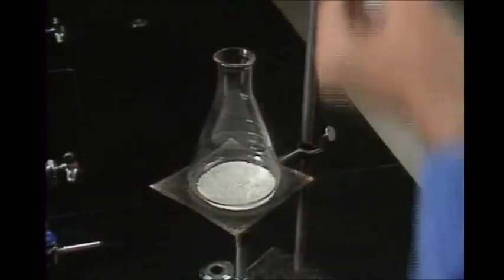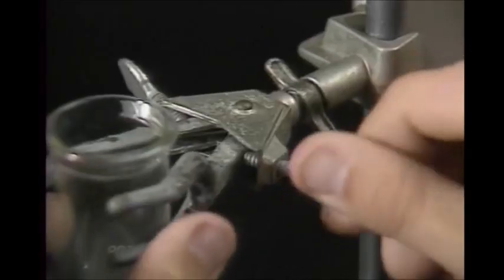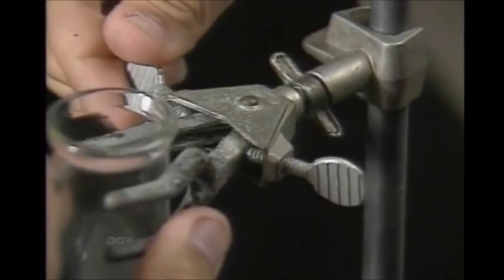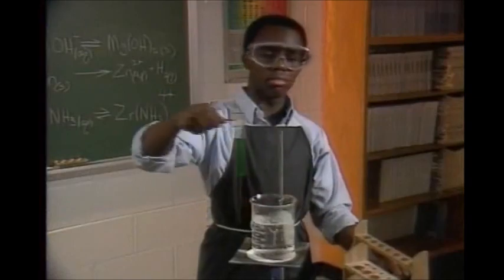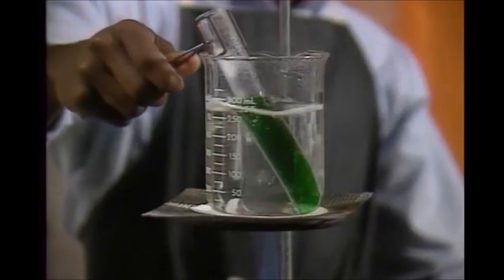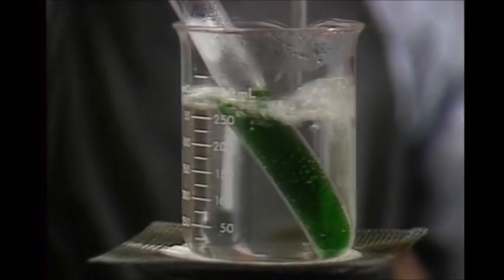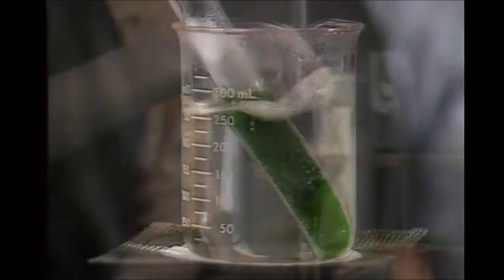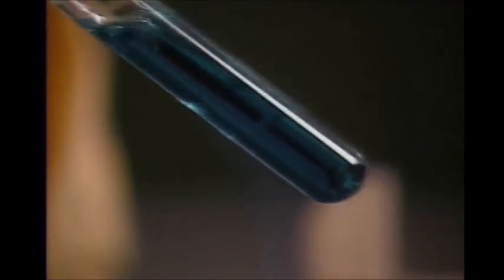Flat-bottomed containers are normally heated on a wire screen on a ring stand. Erlenmeyer flasks and other narrow-necked containers should be secured to the stand with a clamp. Test tubes can be heated in a water bath. The water bath transfers heat slowly and evenly to the test tube and helps keep it from boiling over. You can also heat a test tube directly in the flame. Hold it at an angle while moving it back and forth to distribute the heat evenly, and aim it away from yourself and your neighbors in case it boils over.